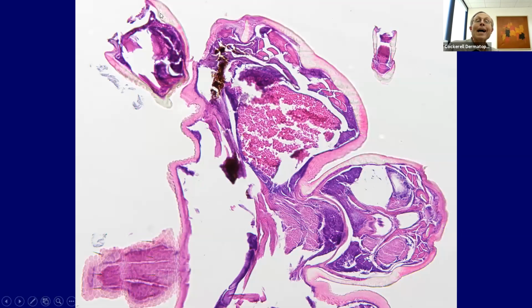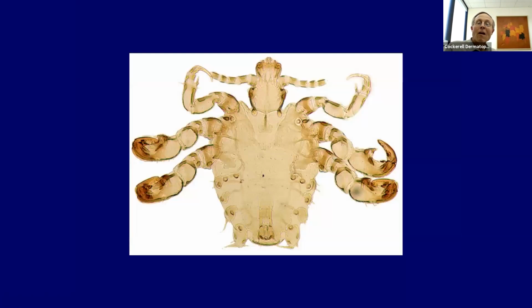It's like you're going to Red Lobster, okay? And he's got a little claw, he's pinching this. Yeah, it looks like a little crab. He's pinching. This is a crab louse. Pediculosis. Okay, this is what we were seeing. There's his head, and we were looking at this little spine over here.